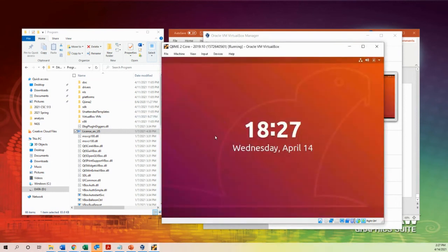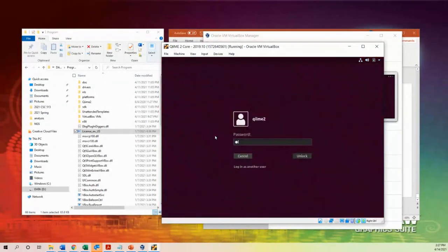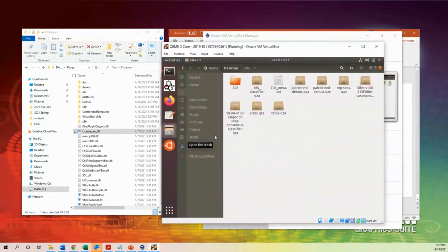Are we all in that step now? Professor, I've actually completed it. What? What did you say? No, I have done all the steps. I have also copied the 708 meta text.